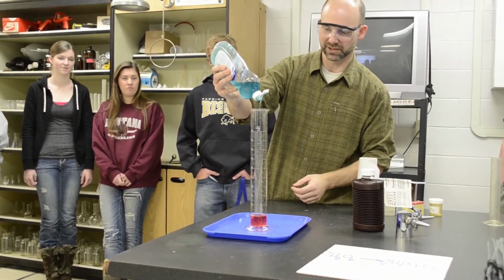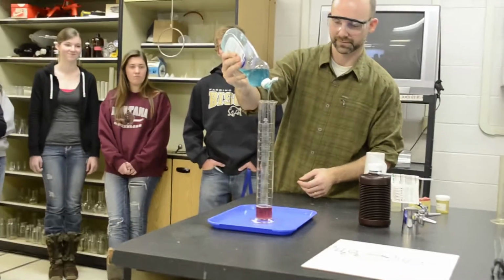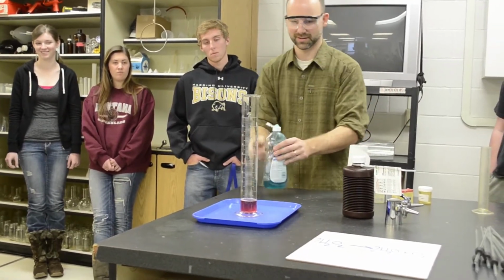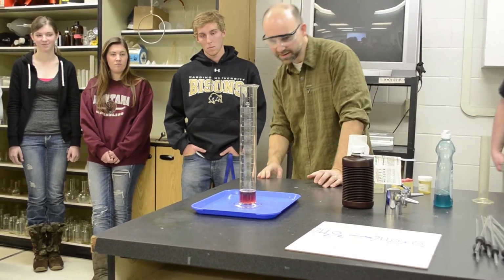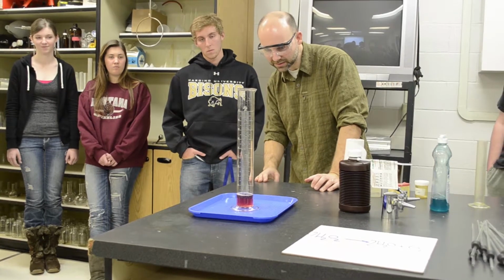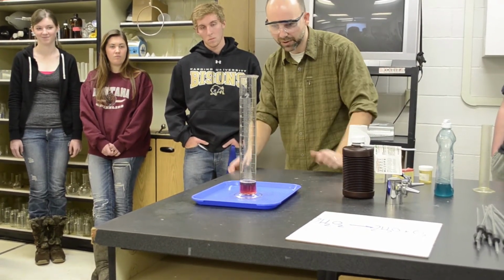So put a little detergent in there. Okay, a lot of detergent in there. You see how it's starting to get a little frothy there? Oxygen's being produced. We're just going to give this a moment to mix up really well.